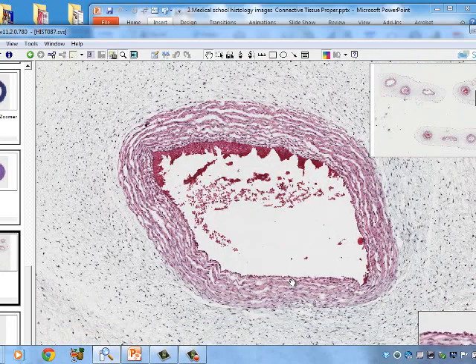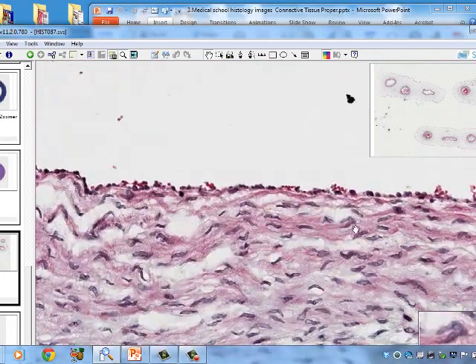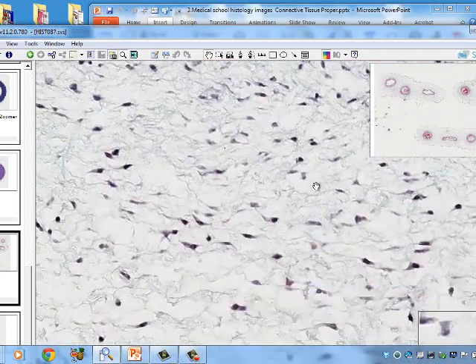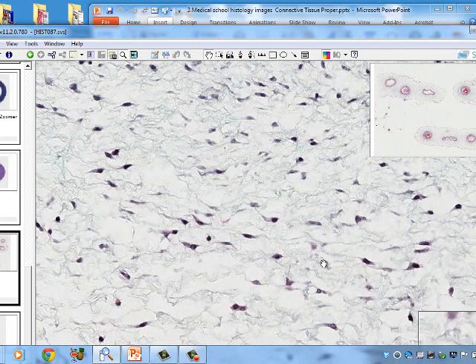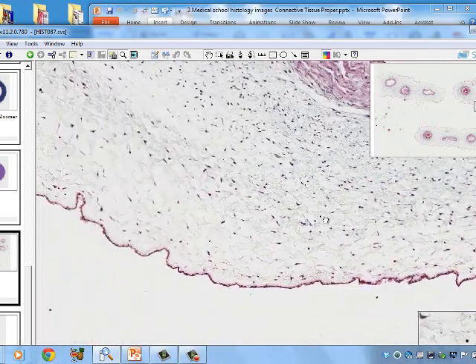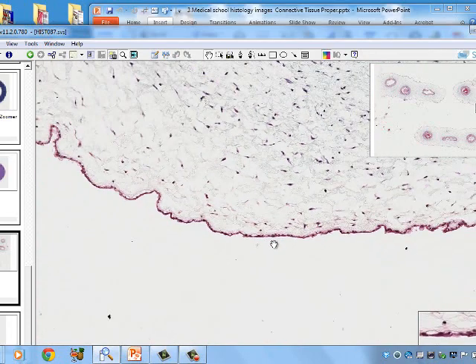In the umbilical cord slide, we see the two arteries and a vein, which look very similar to each other. Smooth muscle cells and endothelial cells are visible within the vessel walls. The mucous connective tissue in between has very fine fibers — not the coarse collagen seen elsewhere — along with fibroblasts. An epithelial layer lines the outside of the cord.